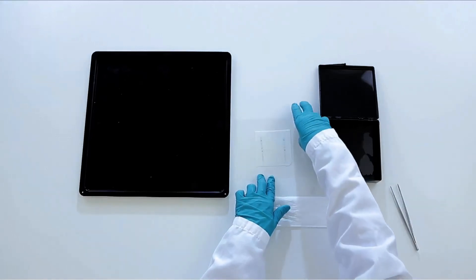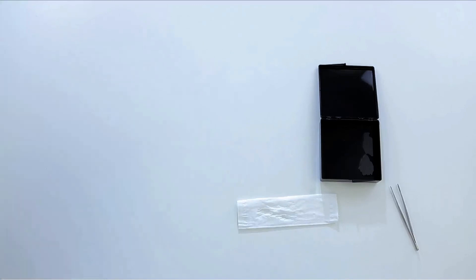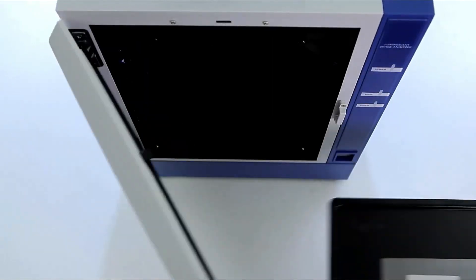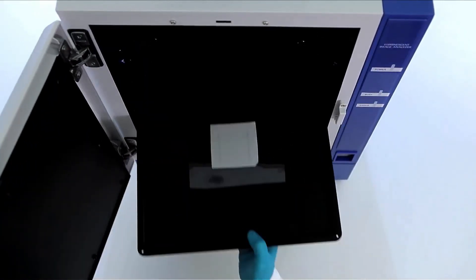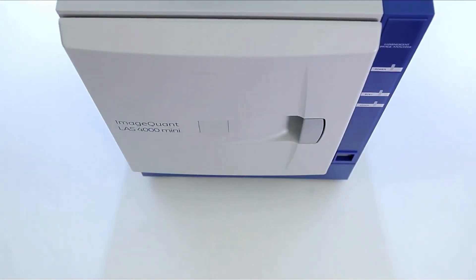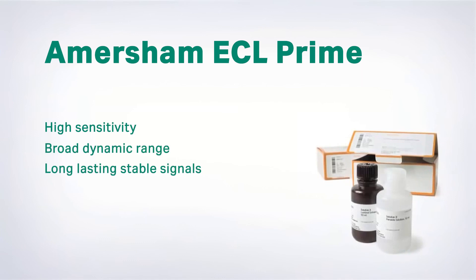Now you are ready for detection. X-ray film can be used, but a CCD camera is a better choice. There is no time pressure — the reaction is instant and the signal will last for hours. Place the membrane into the LAS-4000 or LAS-4000 mini CCD imager. The stable signals let you repeat exposures to achieve the best sensitivity. ECL Prime with CCD imaging gives you high sensitivity, broad dynamic range, and long lasting stable signals. For best results, remember to optimize exposure time. Follow the steps in this video and ECL Prime will give you results you have only dreamt about.